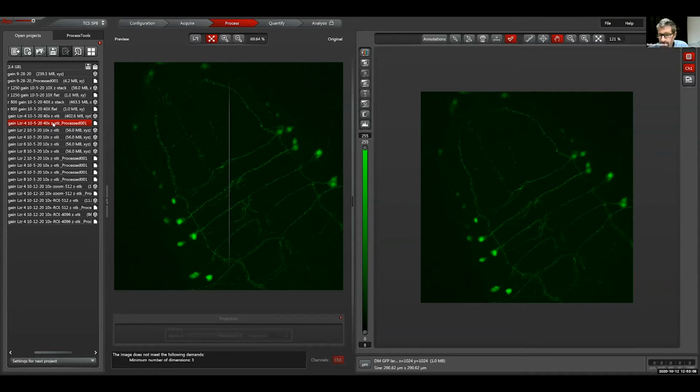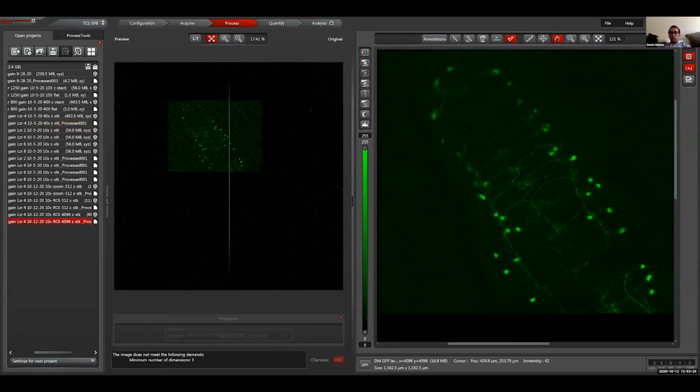Right? There's not as many... I noticed it was kind of highlighting the center portion a little bit on the last one. Just those few highlights in the middle of those axons.